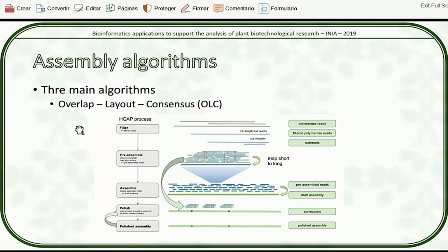Finally, the consensus is something that most of the assemblers do agree on. They usually use the same algorithm, or just very few. There are very few algorithms for the consensus calculation, and you could argue that the most reasonable one is the majority one. If you have 10 reads all aligned together in the same position, and you have 9 A's and 1 T, you can assume that the T is wrong and the A's are correct, right? It's a sequencing error. Yeah, but that's the consensus part. The other two parts, those are the most difficult ones.